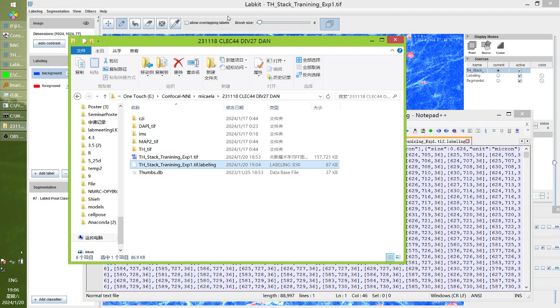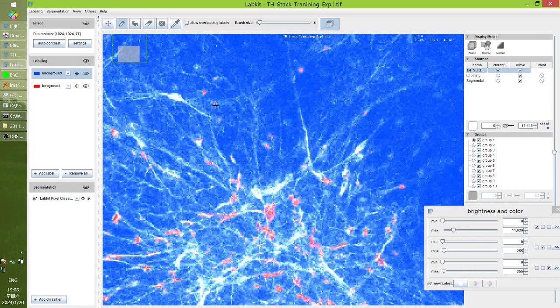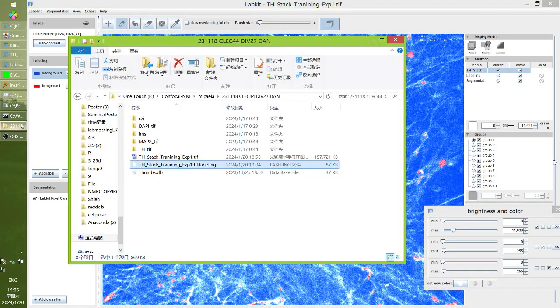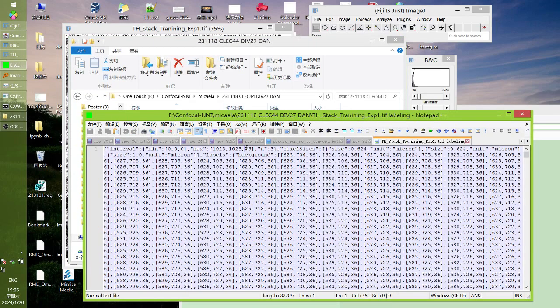If you do not change it, it may also load, but the label does not correlate with the raw image. The position will shift to other slices because the shape is not consistent. For example, I will show you a bad example. And I close this. I will change this number from 76 to 56. Okay, so the number doesn't match. So what will you see?